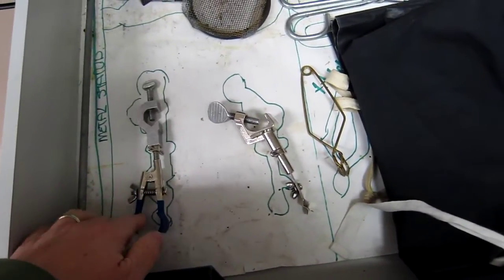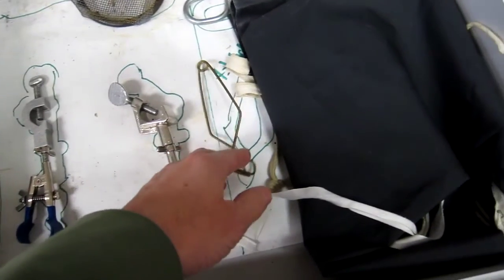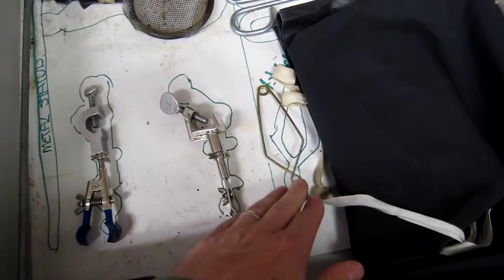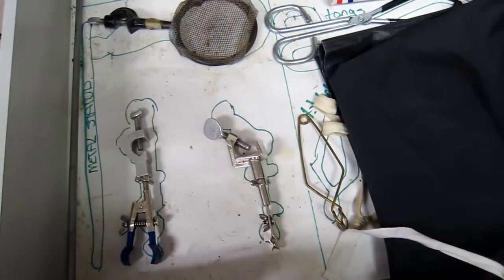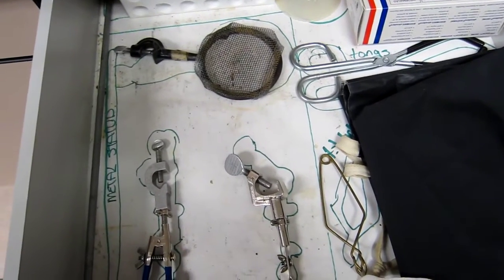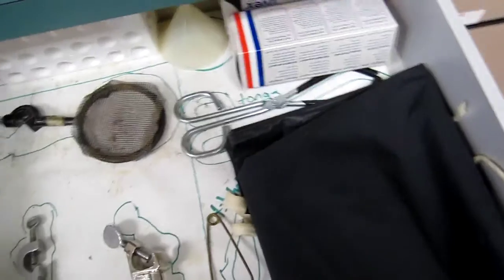You have test tube holder. That's a thermometer clamp. This is a test tube holder for a ring stand. This is a test tube holder just by hand, so you can grab a hot test tube. This is part of your ring stand. That's the ring that goes on it with a wire gauze. Tongs to hold hot things.